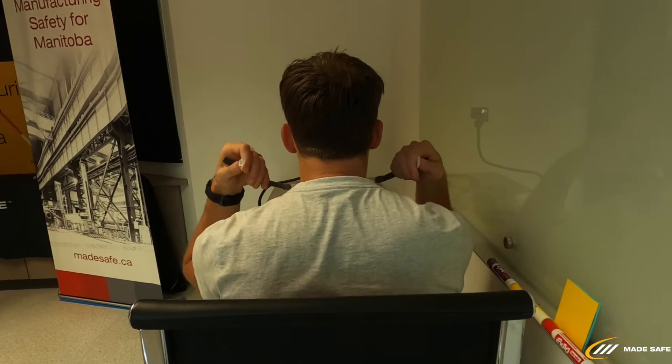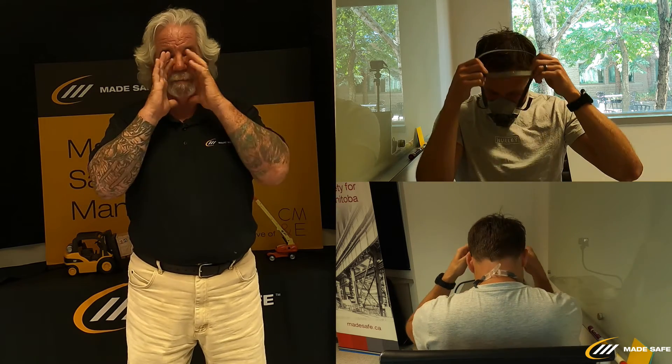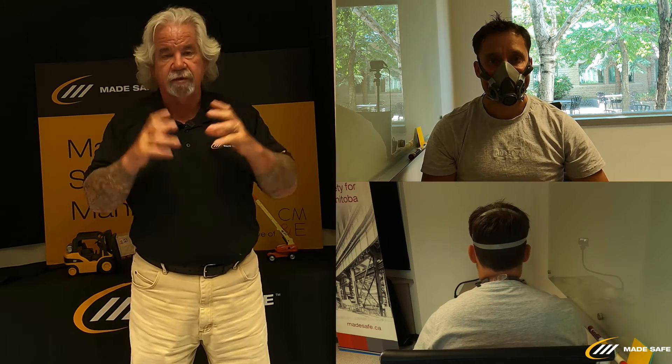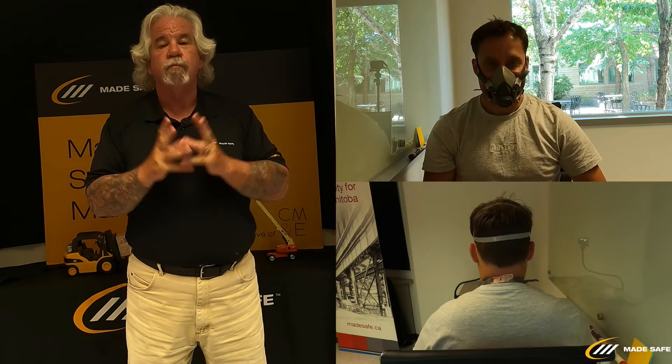For the half mask, the process is very similar. I'll ask Reg to hold the mask in front of him, take the neck straps, and clip them on around the back of his neck. Again, if you have long hair, remove it from underneath the strap — you need the strap against your skin. Then Reg will take the harness and bring it up over his head, bringing the mask up onto his face, and snug the mask up until it's in a comfortable, tight position.